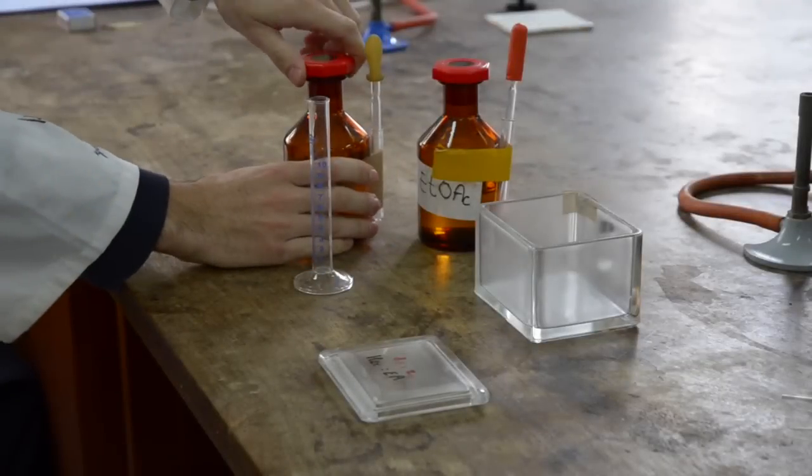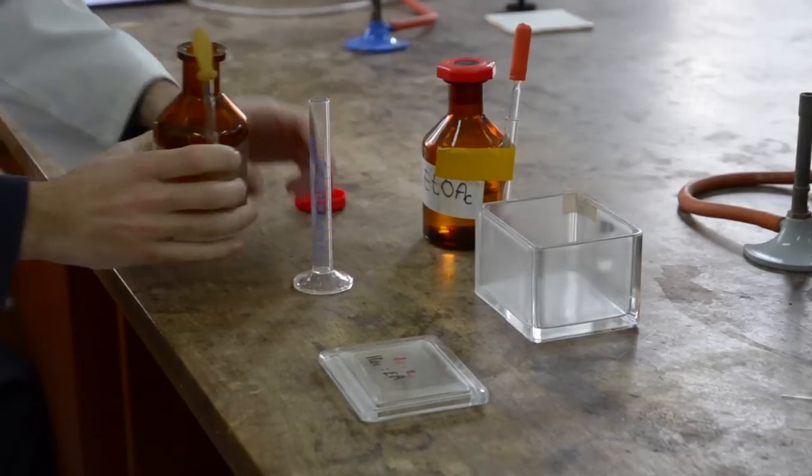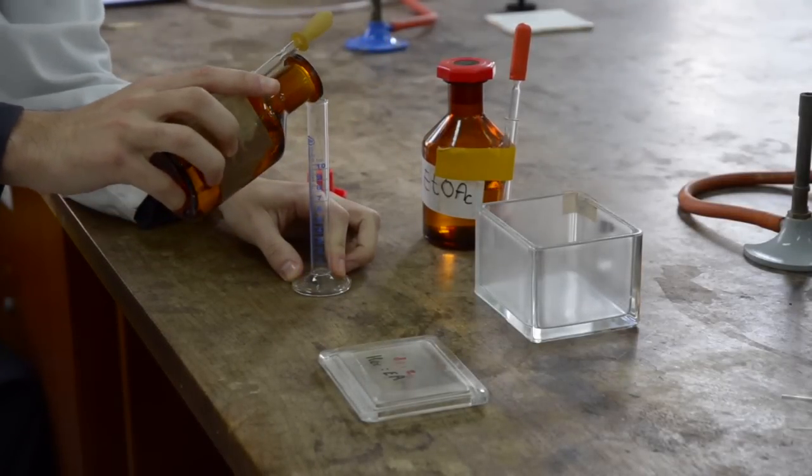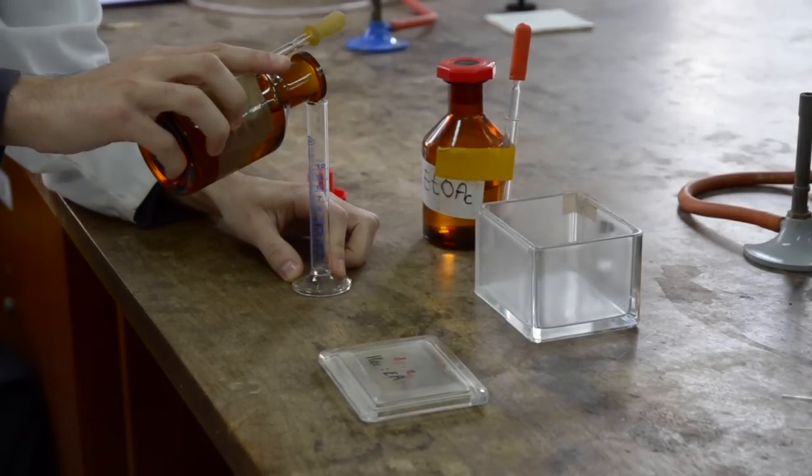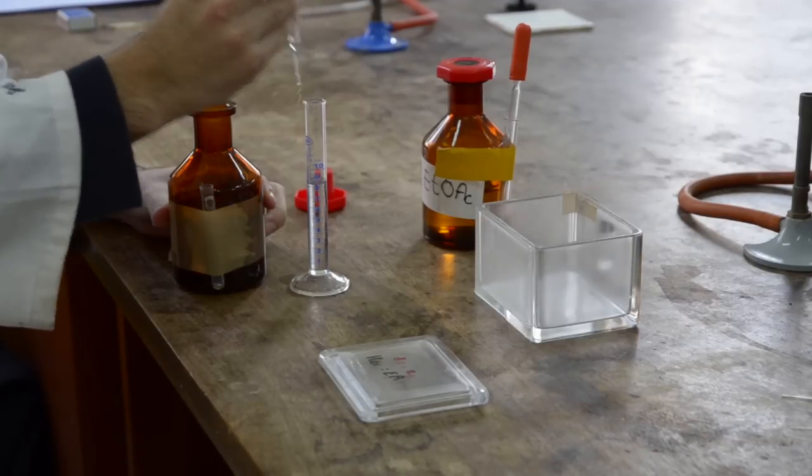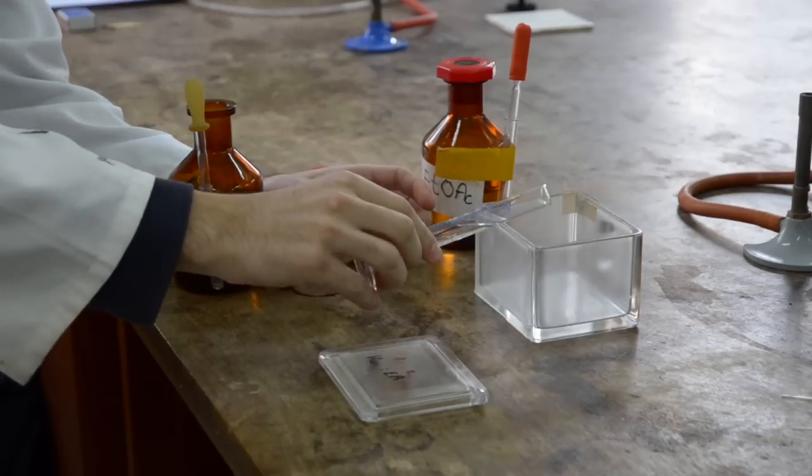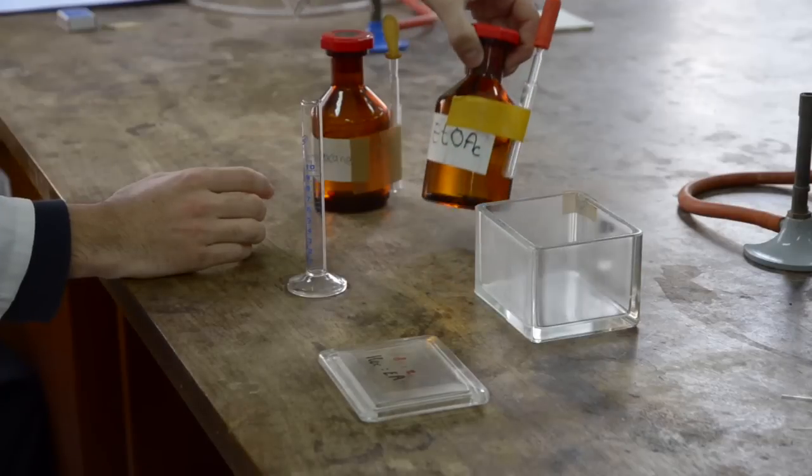Fill your solvent jar with the appropriate eluant mixture. Usually a mixture of hexane and ethyl acetate is used, generally in ratios of 6 to 4, 7 to 3, 8 to 2, or 9 to 1.